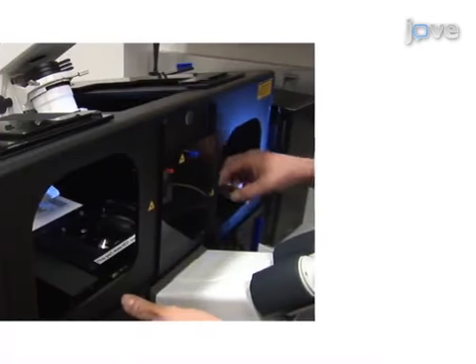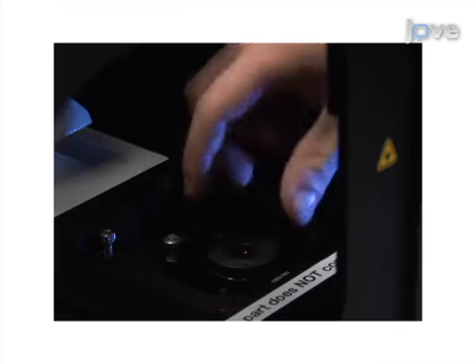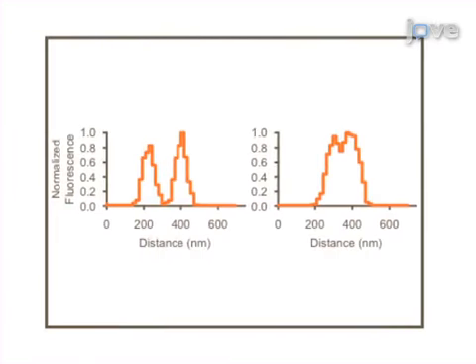In the second step, sparsely sampled raw images are collected with a super-resolution microscopy system. Next, the raw images are processed to produce a super-resolution image. In the final step, the data is quantified to elucidate the organization of the vesicles.